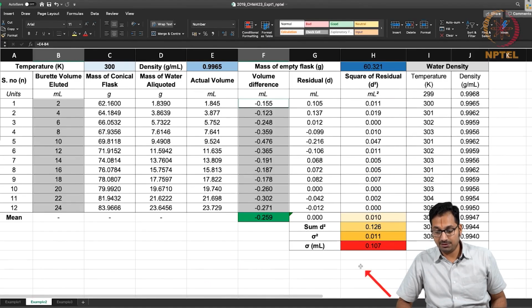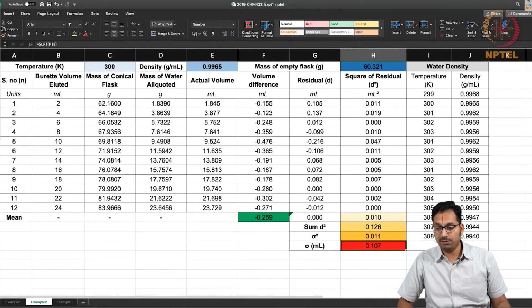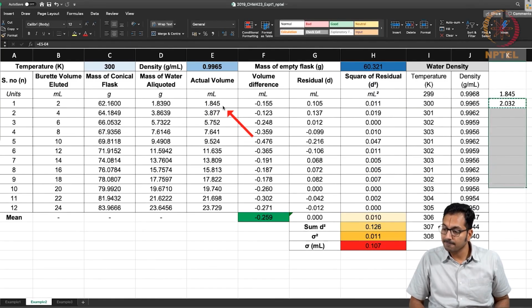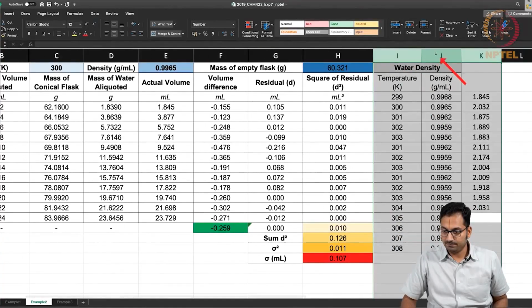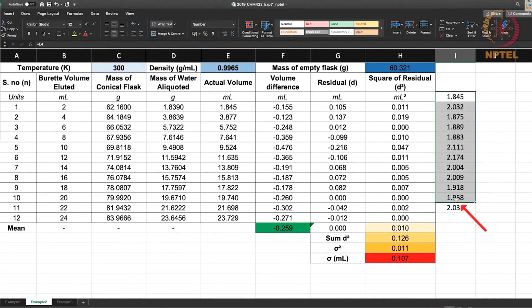Of course, repeating the analysis here, you end up getting a standard deviation that's very close. You got 0.1 earlier, you're getting the same 0.1 here, but let's try to see what is the accuracy that comes up for this measurement. Once again, we do that by taking a difference between these values. And what you are able to realize here is that the researcher has had an initial measurement which was about 0.15 away, and there are some measurements that once again keep on repeating to a similar magnitude. So now let's quickly figure out what is the average.